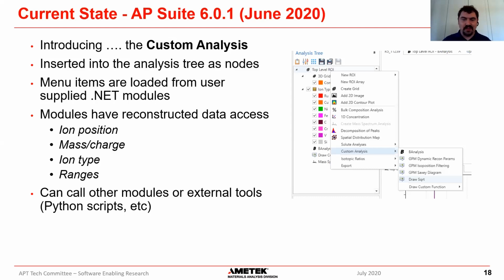So everyone was using Visual Studio anyway to edit their modules. So we decided just to make it fully into the Visual Studio world. So you can still add a C# console. There's a special type of external module. It's called, if I remember correctly, a custom analysis with console, and then you can have your C# window if that was a way that you'd like to do it before.